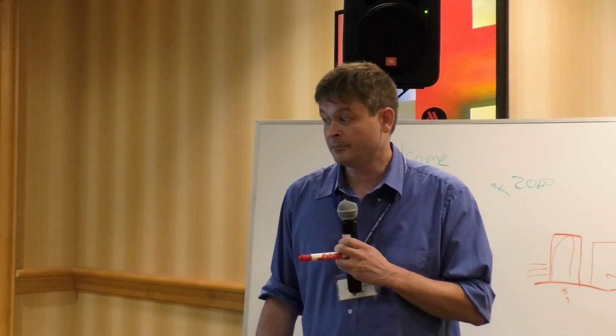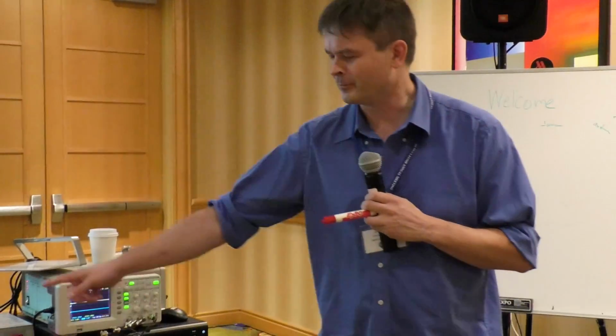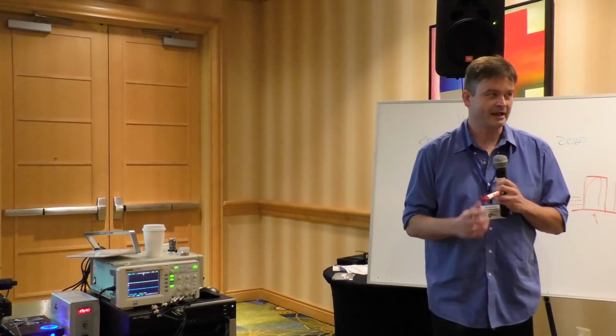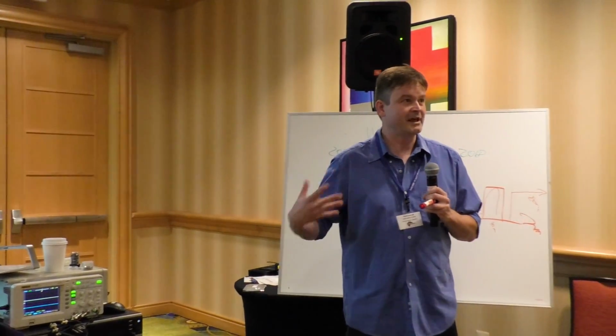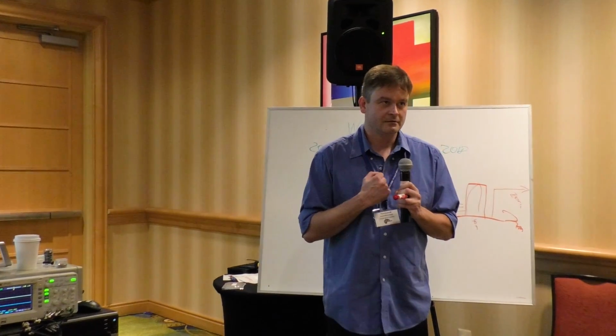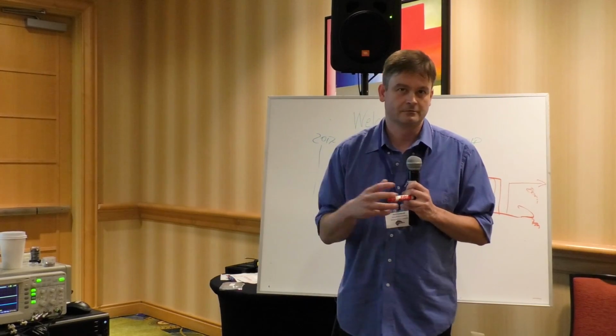And then there's people like me who think, oh yeah, we have a tissue culture microscope. Why don't we build a Z drive so we can show Z steps? If we go ahead and we build something new, or Jörg's lab, if you come up with something that hasn't been done before, please be really clear and collect everything you can. And that's basically what these levels mean.